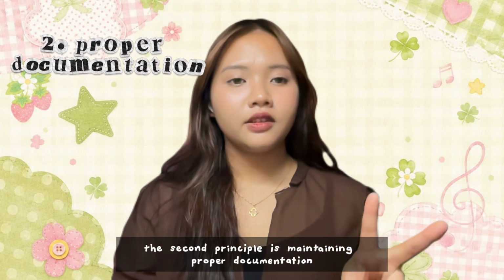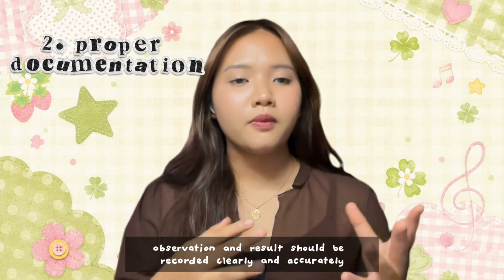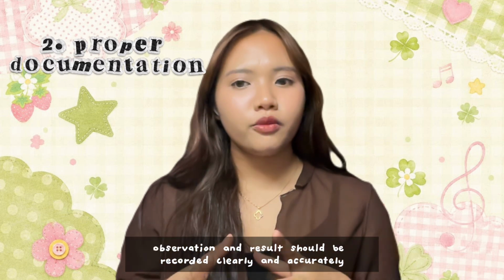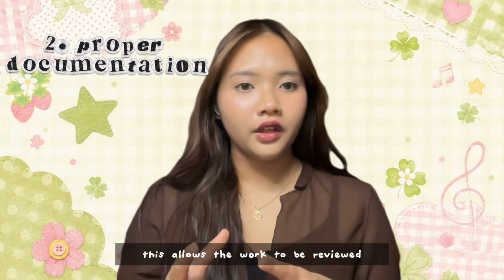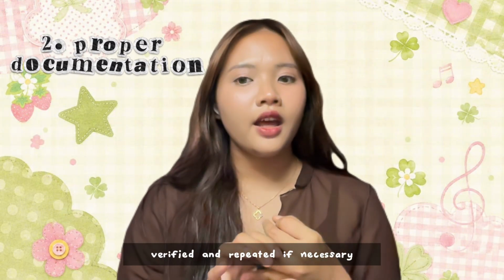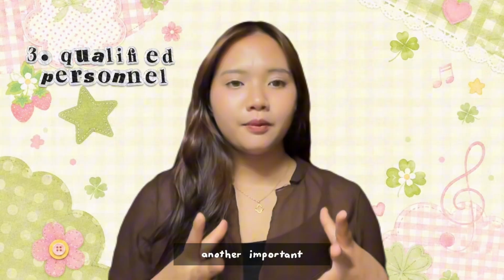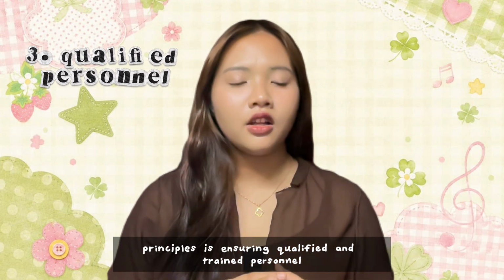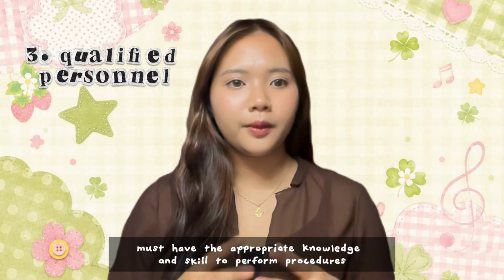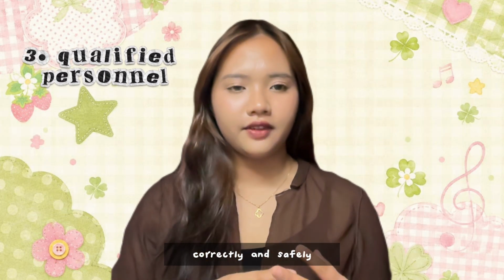The second principle is maintaining proper documentation. Every experiment, observation, and result should be recorded clearly and accurately. This allows the work to be reviewed, verified, and repeated if necessary. Another important principle is ensuring qualified and trained personnel. Laboratory staff must have the appropriate knowledge and skill to perform procedures correctly and safely.